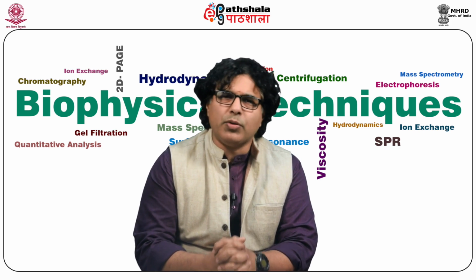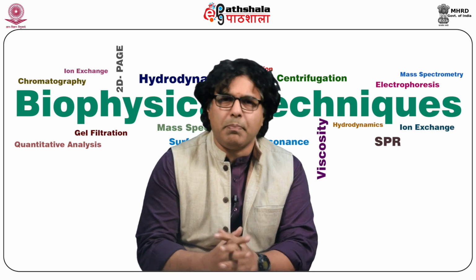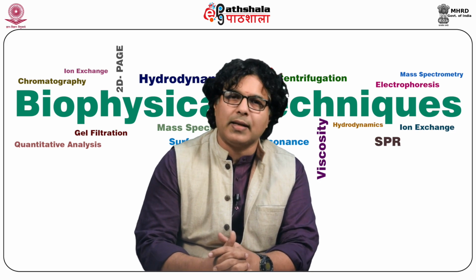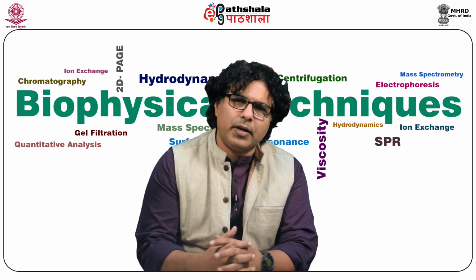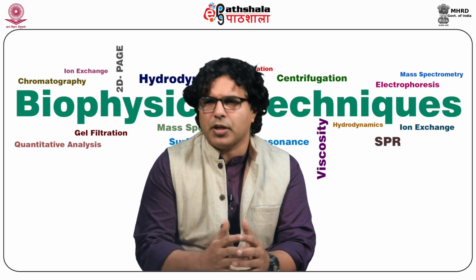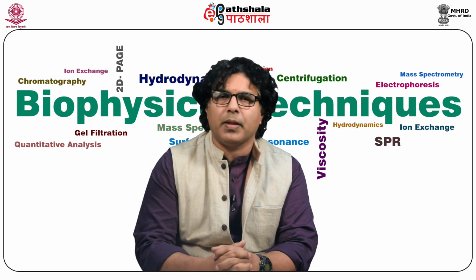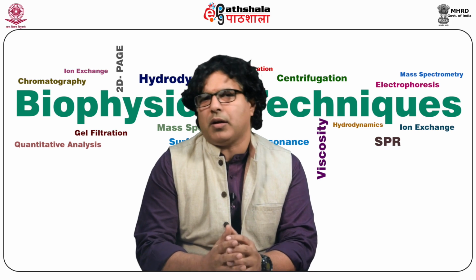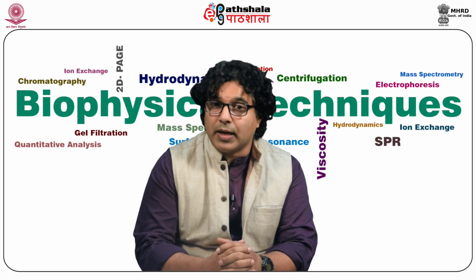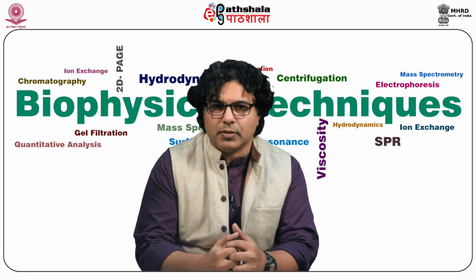Sometimes the amount of substance present in the sample is very, very small. For example, you are trying to do an environmental analysis of remnant contaminants. You try to remove the contaminants, but some amount is left, the remnant is there. So what you try to do is concentrate these solutes to decrease the volume, so that you multiply the concentration in that solution.